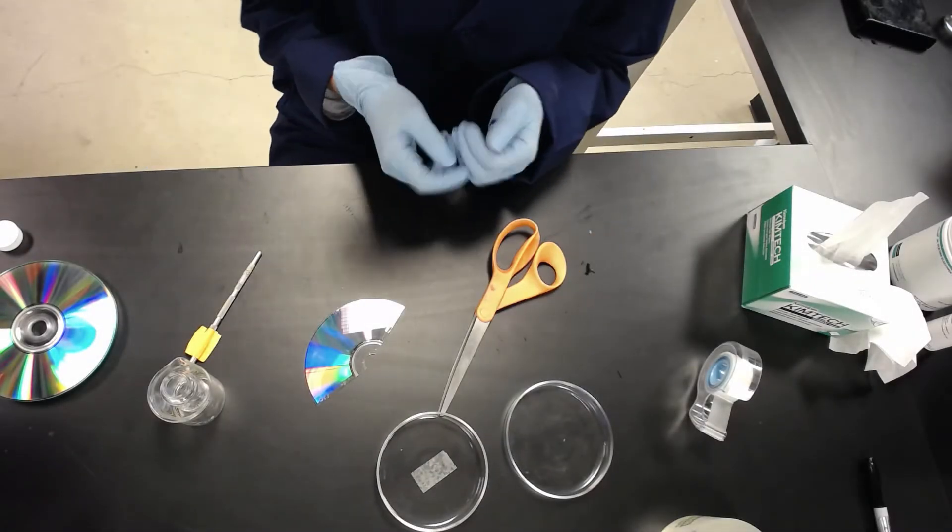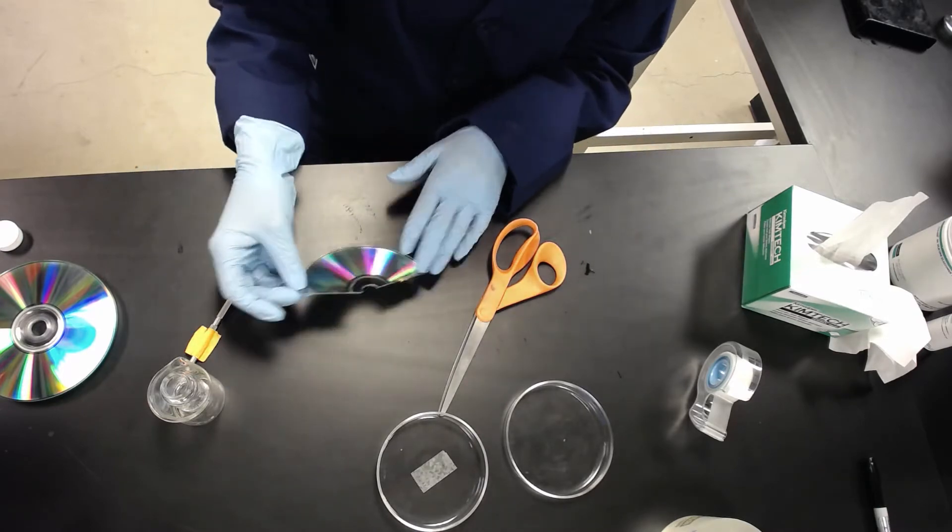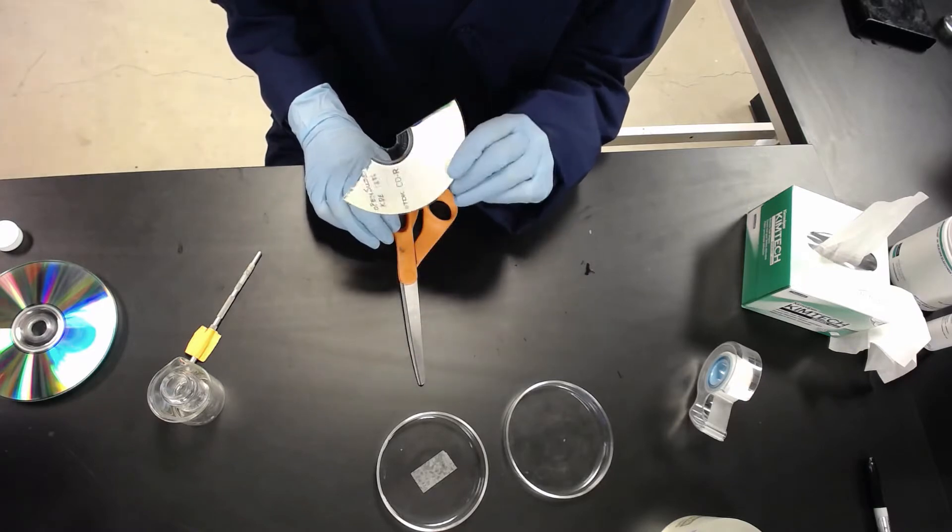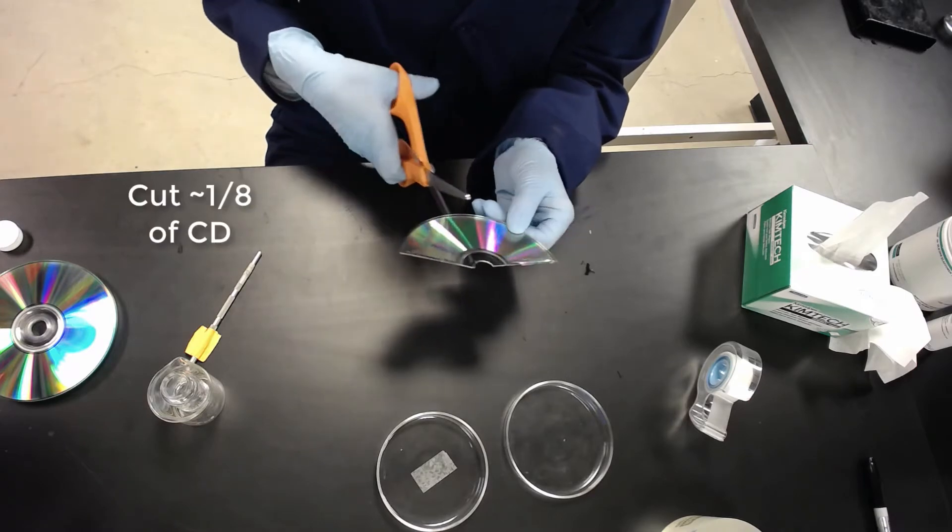Okay, so now we're back at our table and we're going to cut up and prepare our master to make our mold. We've got our CD here, just a regular CD, and we're going to cut about an eighth of the CD.